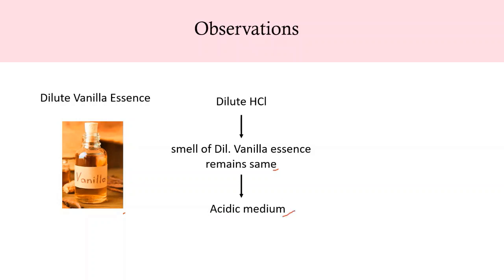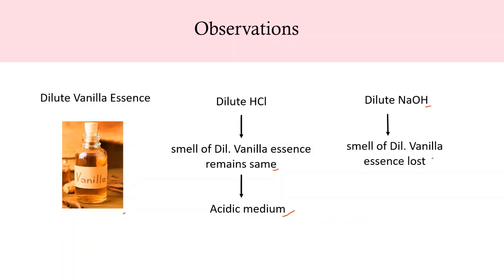When we add a few drops of dilute vanilla essence to dilute sodium hydroxide and shake the test tube, we observe the smell of dilute vanilla essence is lost. By this we conclude that the smell of dilute vanilla essence is lost in the basic medium.